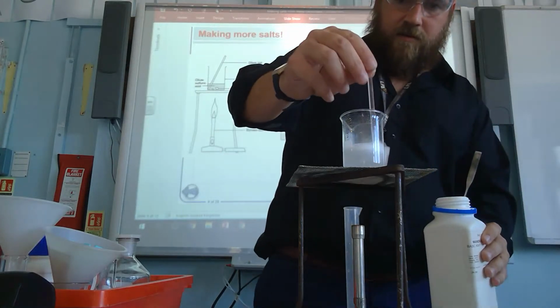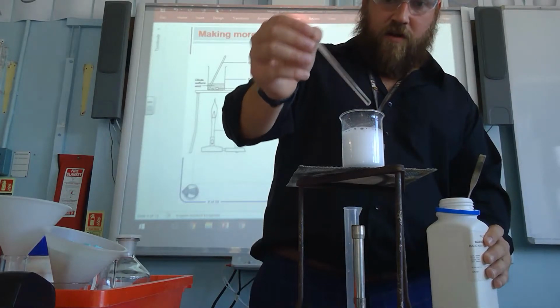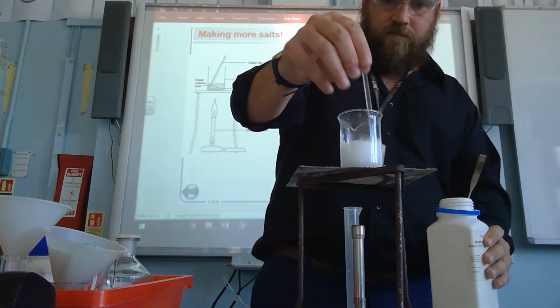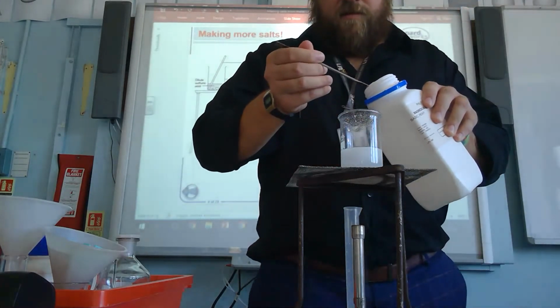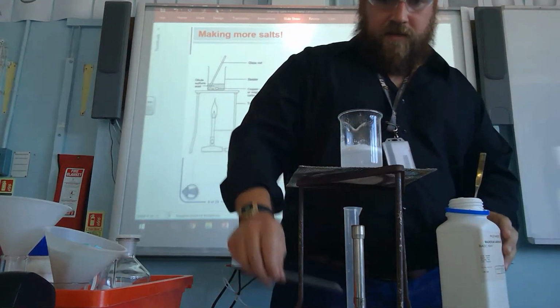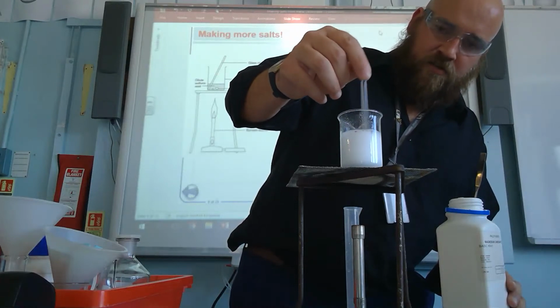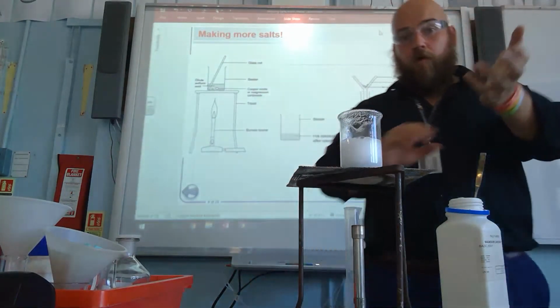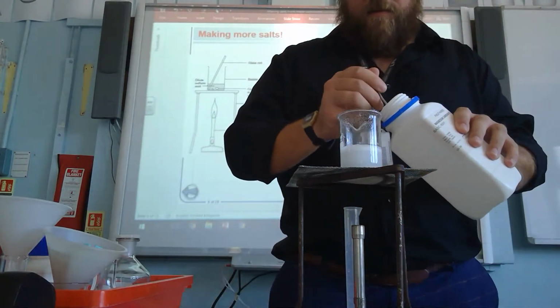And then give it a quick stir. Oh, stay there. Stay. You see it's rising up. Okay. And then we're getting there. It's getting less and less fizzy, and there's a bit of solid left behind now. So I think we're about there. I'll warm it up gently anyway to try and get even more to react, but I think we're roughly about there.